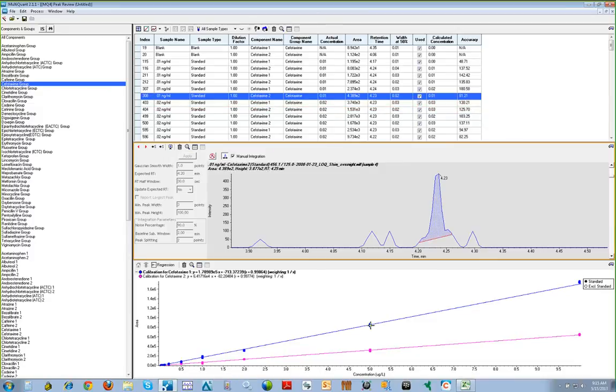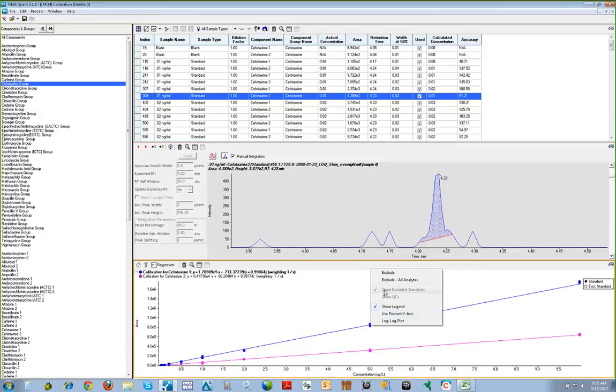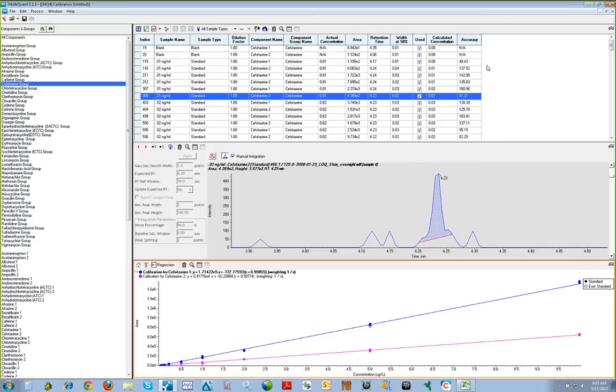If you want to remove a point from the calibration curve, you can right-click and select Exclude, and the point is excluded from the calibration curve and the results table is updated automatically.